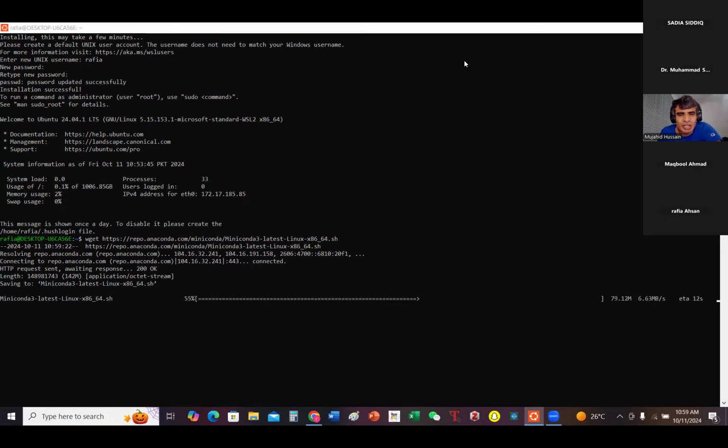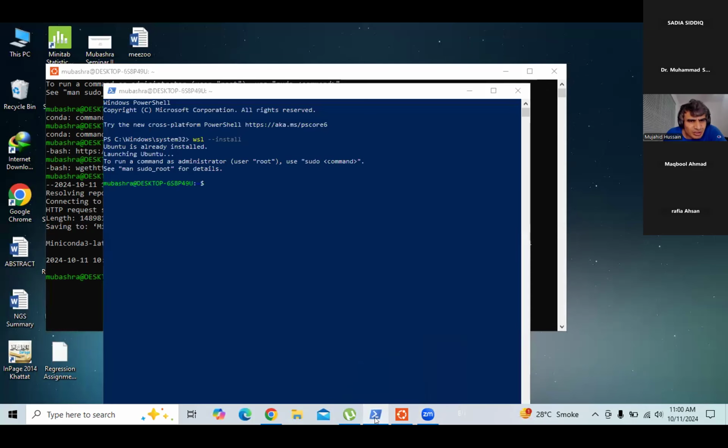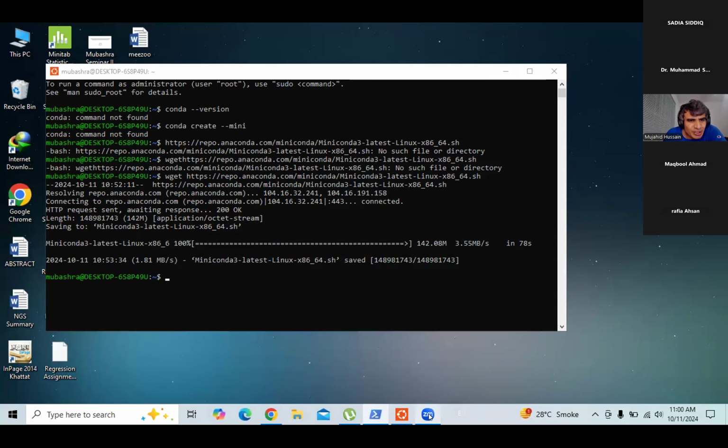We're going to create an environment. So now I'm ready for the environment. Yes. Okay. Can you type here conda?